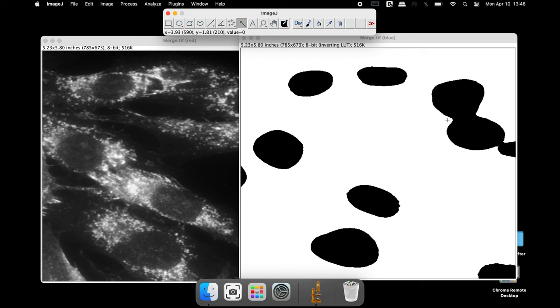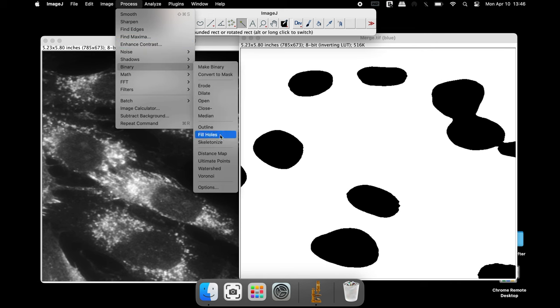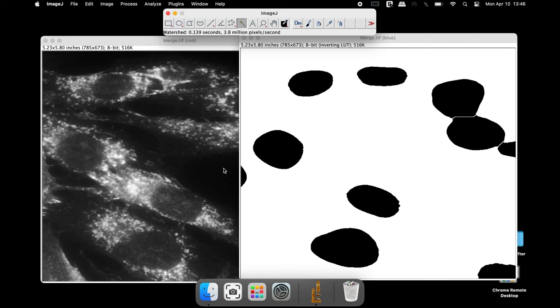To separate the nuclei from one another, click on Process, Binary and Watershed. Now the nuclei are separated from one another.